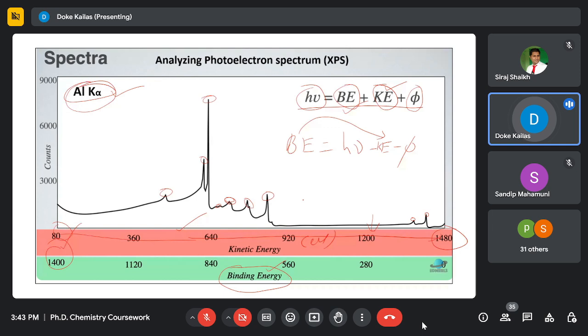We cannot command the X-radiation not to interact with the valence electrons, the 3p or 3d electrons. We want to study proper X-ray spectroscopy, so X-rays can interact with all subshell electrons.